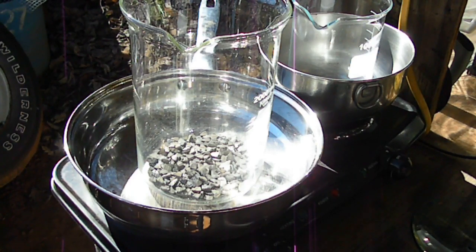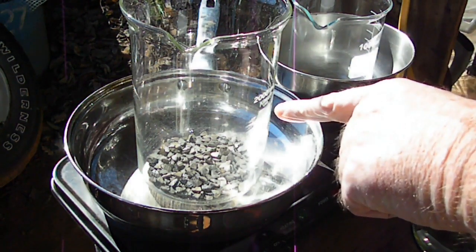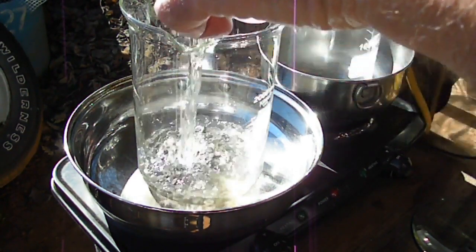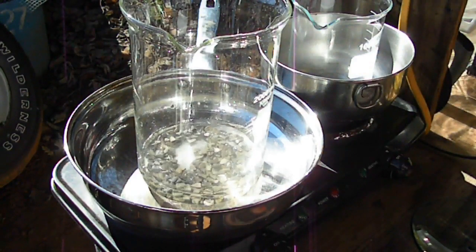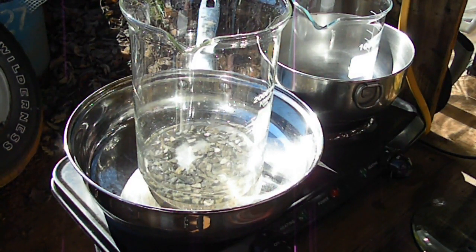So right now I'm going to go ahead and add my water. I'm going to use about 170 mils in this one and about 400 in this one. Really, I can probably get away with even a little less. I'll probably do a little bit less than that. I think I'll do 350 in the big one. So there's two. Again, this is distilled water. Actually, this is water from my dehumidifier. So we're going to go 350 on that one.